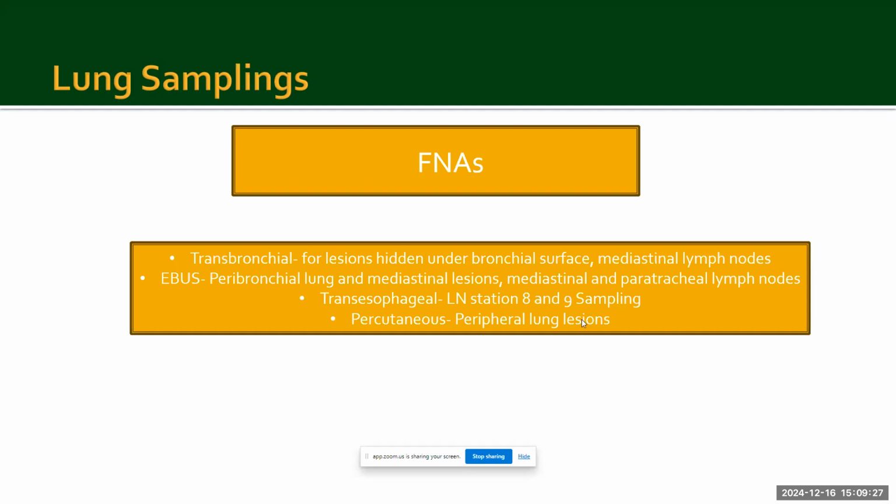Wow, I didn't know there are this many indications for sampling like cytology. When we think about it, I just think it's like screening, just the initial screening. Thank you for that. And also, as a trainee, I always get confused with various types of bronchial samplings. So, could you please tell us what are the key differences between bronchial washings, brushings, and bronchoalveolar lavage?